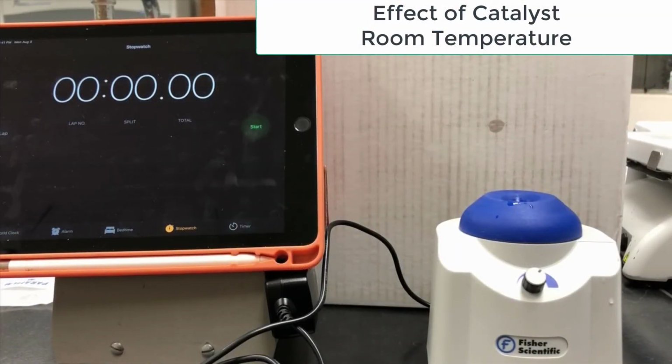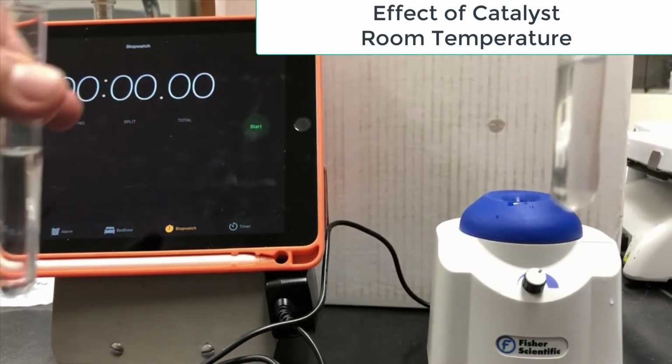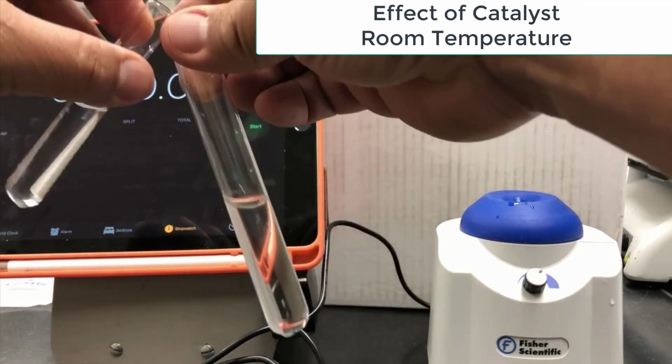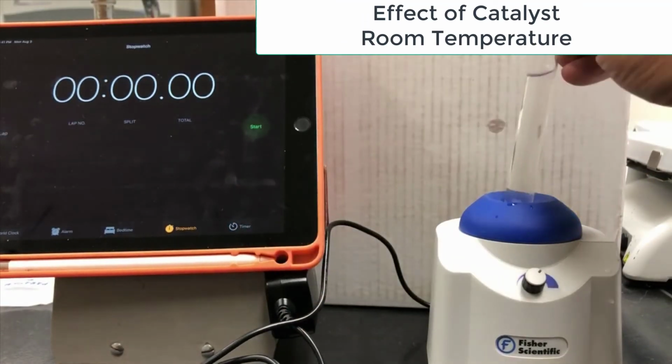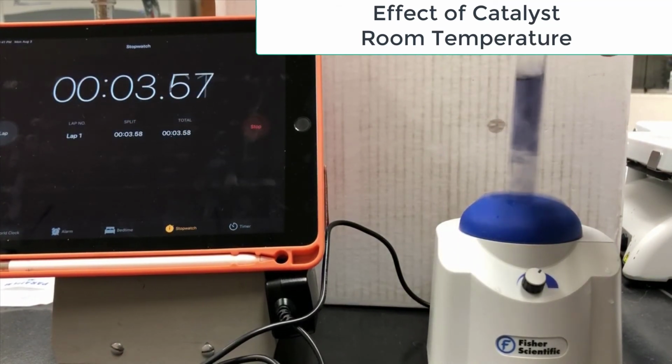So we're ready to do our room temperature trial with catalyst. I'll mix the two together, hit the start as soon as I do that, and start mixing at the same time. I don't know if you saw that. That's kind of what I expected would happen.